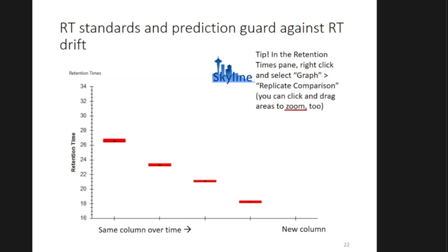That's the new retention time if we have a new column; that same peptide will shoot right back up. So this is a pretty wide drift of 10 minutes. So if I didn't have standards in there to see that the retention time changed by 10 minutes, I could totally mispick that peak because I'm looking 10 minutes earlier in my gradient.